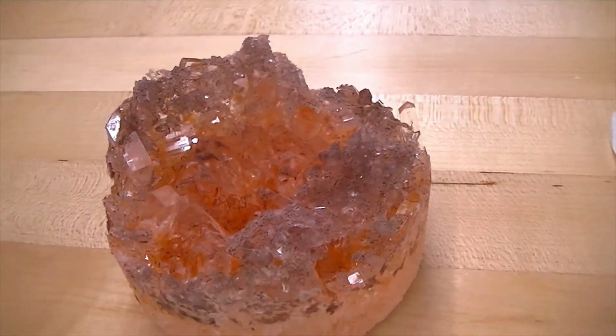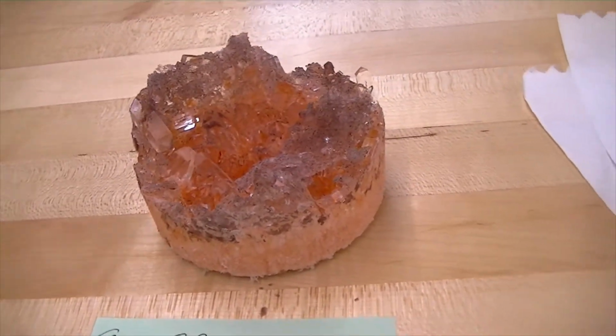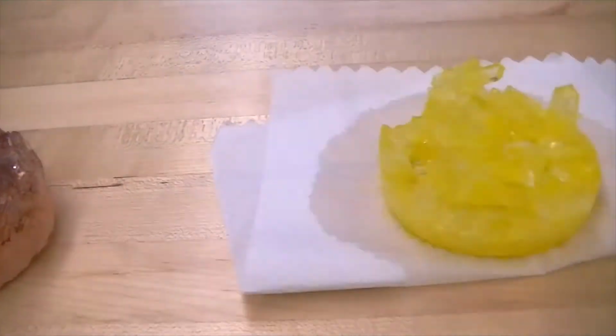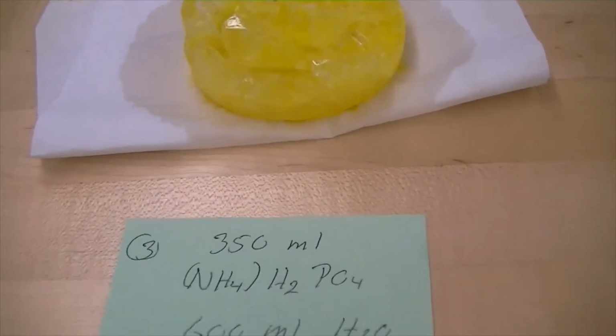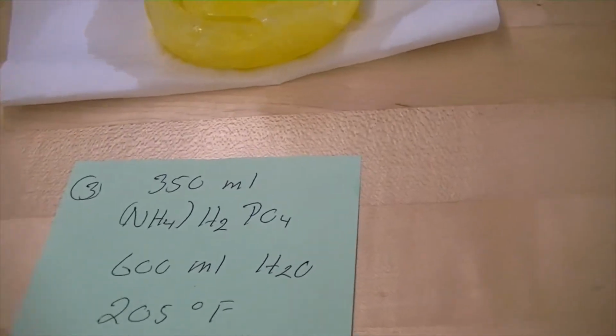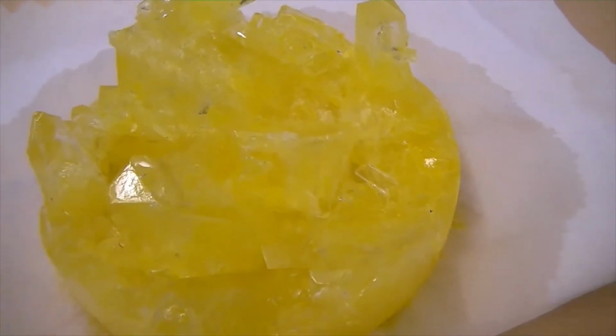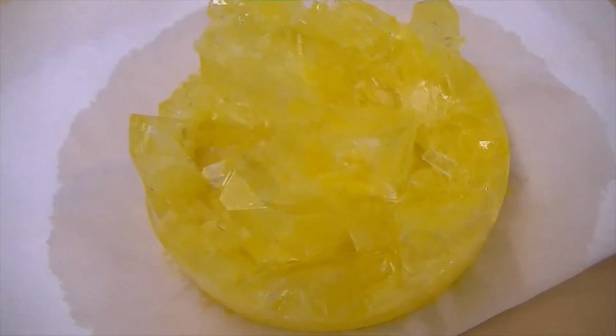So all these were placed in the same room, same temperature. Sample number 3 is 350 milliliters. And these are the crystals that formed as a result of that.